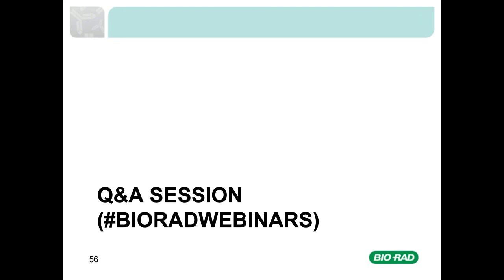It might also be worth considering that if you intend to include a negative control or a mock IP alongside your second target, the lysate being used for both of these IPs needs to have been treated in an identical manner during the previous round of IPs. So what you might find is it's easiest to actually pool your mock and target lysates at the starting point before you perform your second IP.